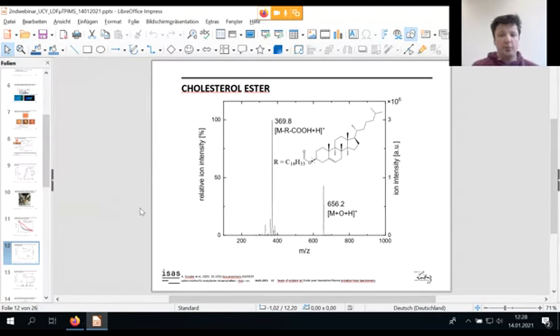So now we finally get to our more interesting analytes, except for the mass calibration solution. Besides cholesterol, I also tested cholesterol esters, which seem to show some fragmentation tendencies. Cholesterol is still detected as a fragment, as a dehydrated cholesterol, but the ester also generates a fragment which is on the same mass.